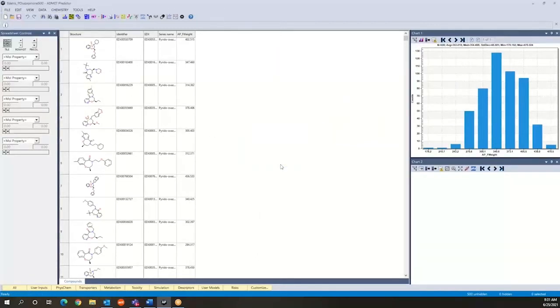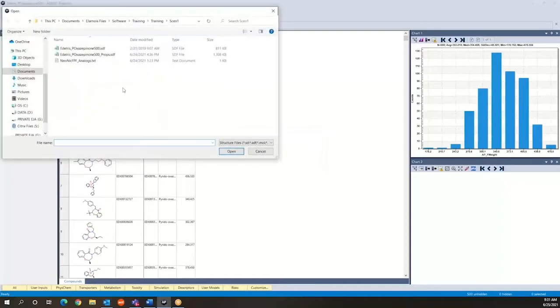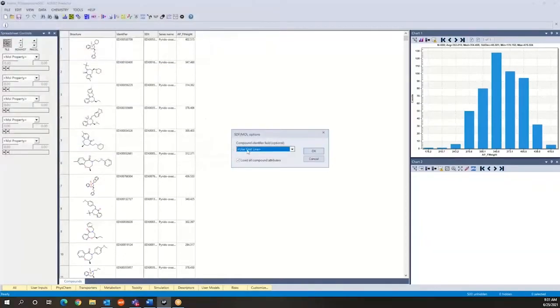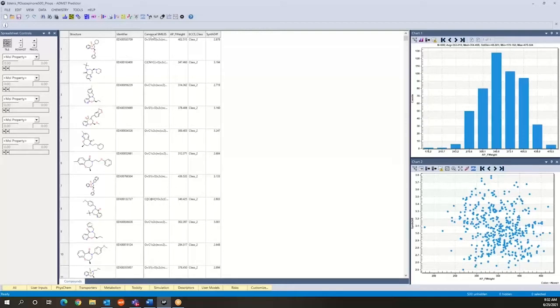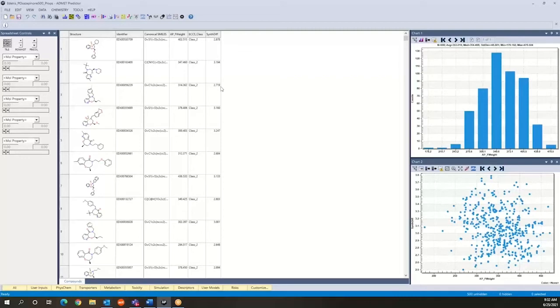Through the same open process, you can load the structures and the properties that are associated with each record. So here, you see that alongside the compound, we've imported the canonical smiles, the molecular weight, the ECCS class, and the synthetic difficulty information. So again, that is something that automatically happens as part of the loading process when that information is provided as part of the file.